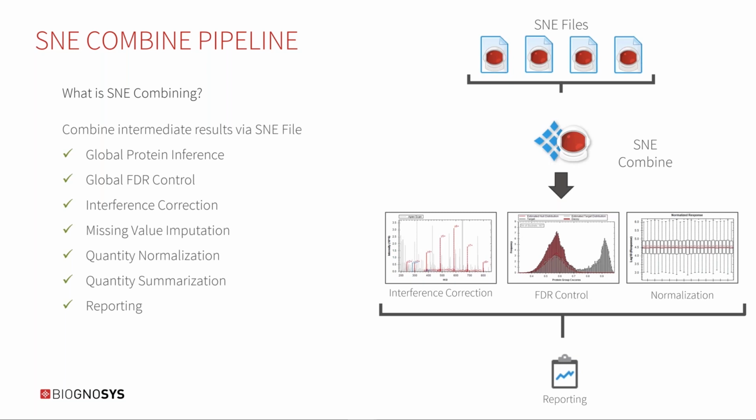And when we were developing this, we were also focusing a lot on scalability in general. That was one of the main focuses for developing this new pipeline. So we were not as concerned about runtime, but we wanted it to scale basically till the end.